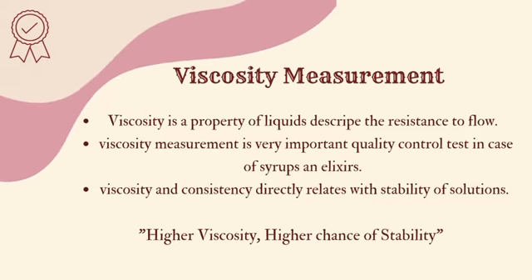Viscosity measurement. Viscosity is a property of liquid that is directly related to resistance to flow. Viscosity measurement is a very important quality control test in the case of syrups and elixirs. Viscosity directly relates to the stability of the solution. The higher the viscosity, the greater the stability.